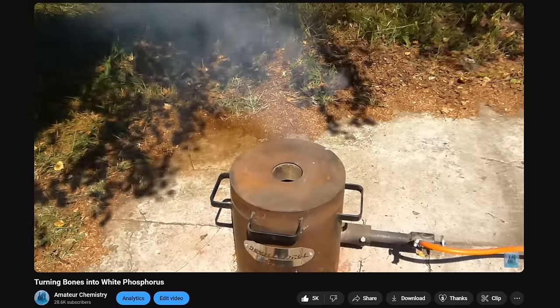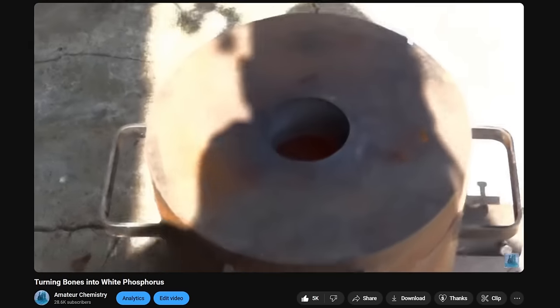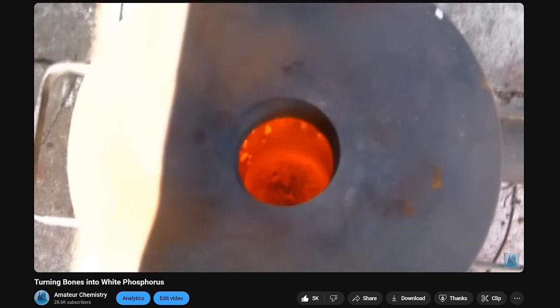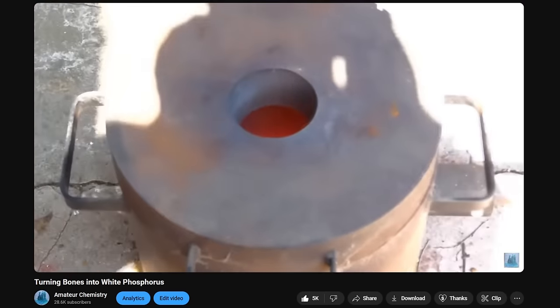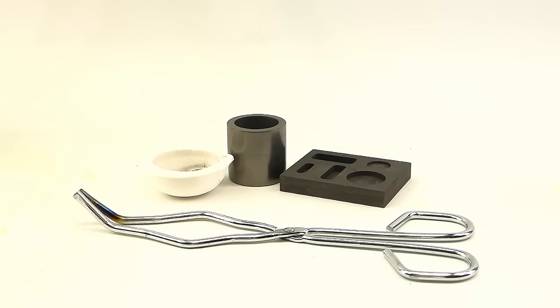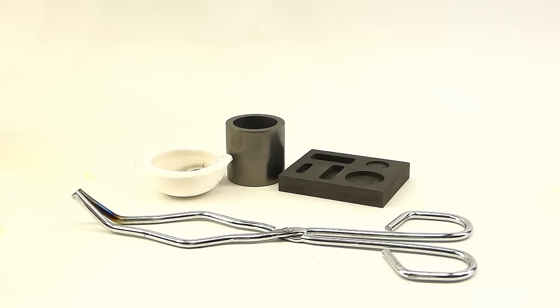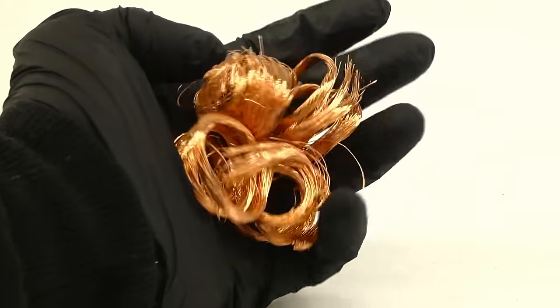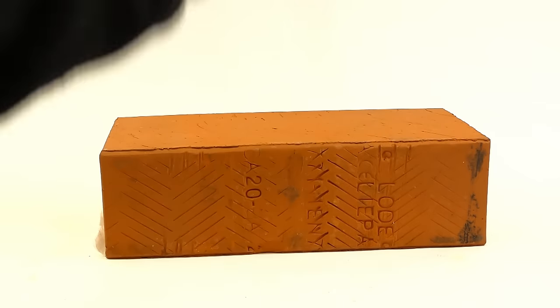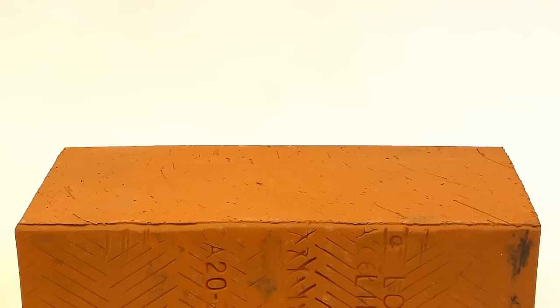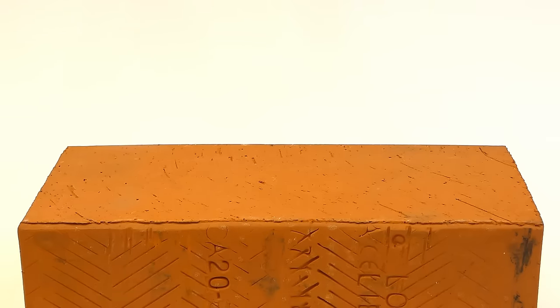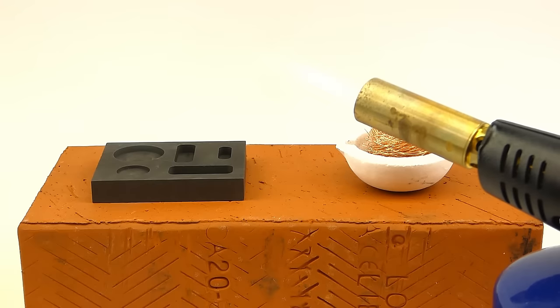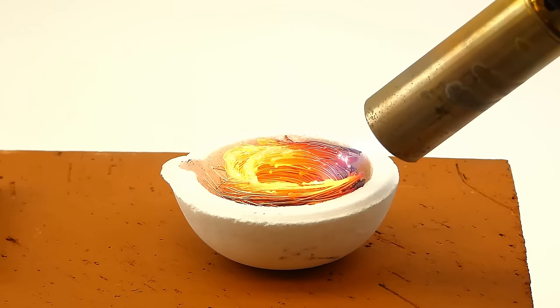You might have already noticed that I have a real good metal melting furnace that I used for example in the white phosphorus video, and it would be perfect for melting the copper, but unfortunately, it is in my other lab, which I don't have access to now. So instead, I will use this cheap Chinese metal melting set, along with this chunky blowtorch. I made some more copper wire coils, and got my good old lab support brick, which will protect the fume hood from being obliterated by the blowtorch. With everything ready, I got one copper coil into the crucible and started blasting it with a blowtorch.